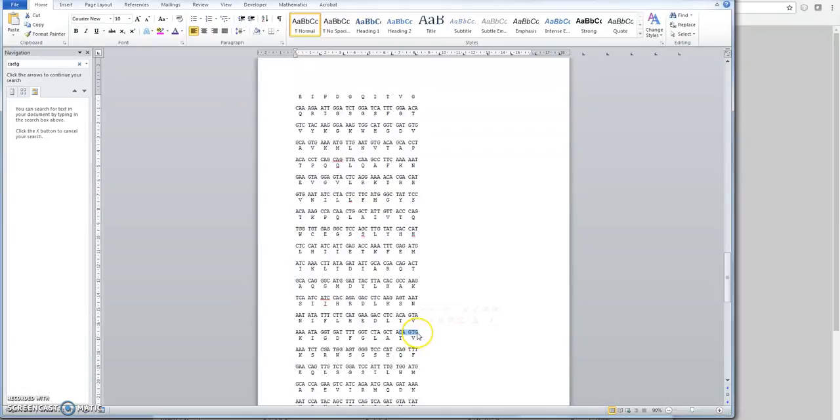So I'm happy that the sequence of our primers is recognizing a bit of the DNA that codes for the region around valine 600. We've got primers that work in the right place, which is something that we have now verified.